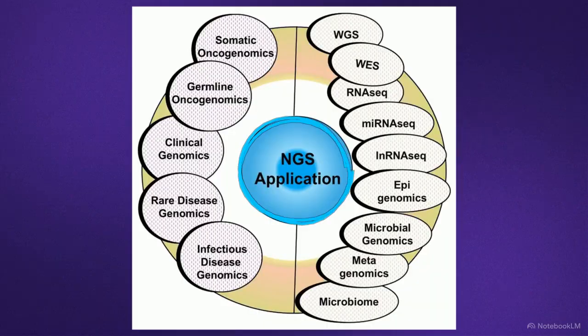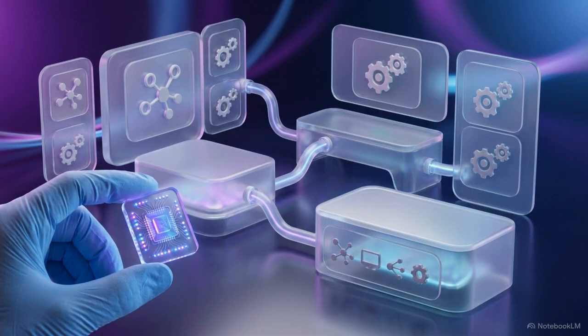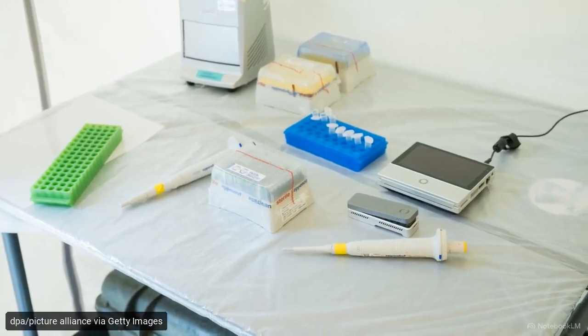This circular diagram maps out how NGS applications extend far beyond cancer. This exact same pipeline was used to track SARS-CoV-2 variants in real time during the pandemic and continues to diagnose rare Mendelian disorders in newborns today. Hardware capabilities are also accelerating. Emerging technologies like single-cell sequencing and portable long-read sequencing devices, like the Oxford Nanopore system shown here, are pushing the pipeline's capabilities into the field.